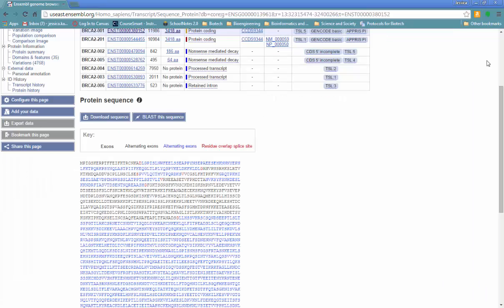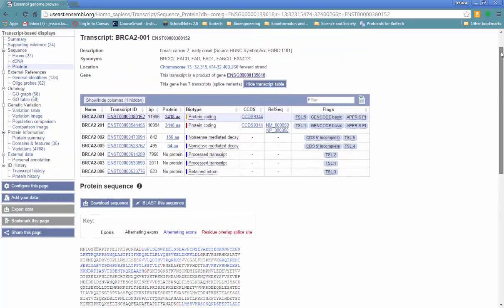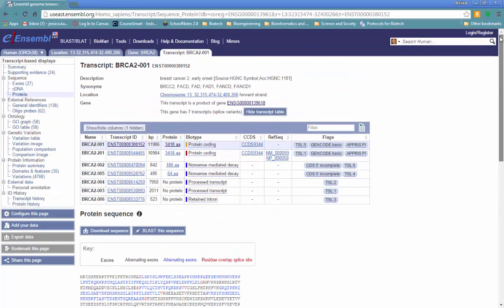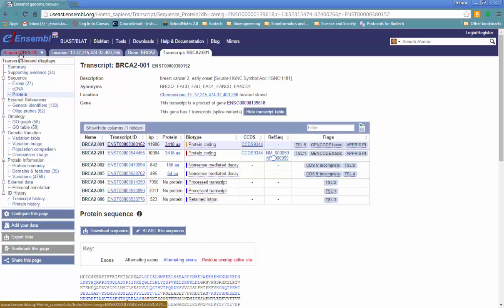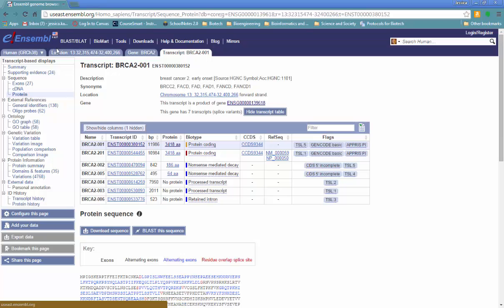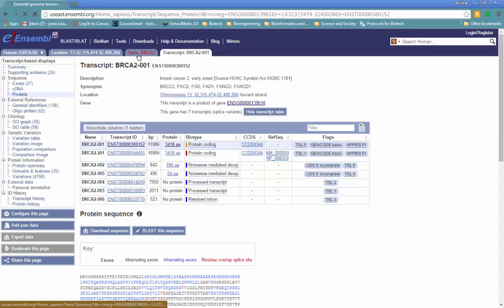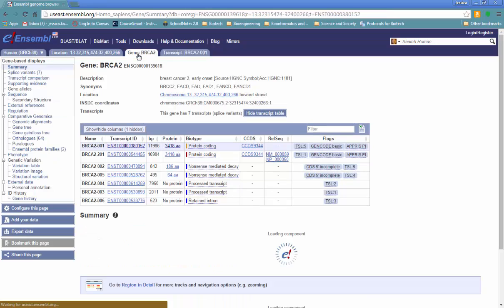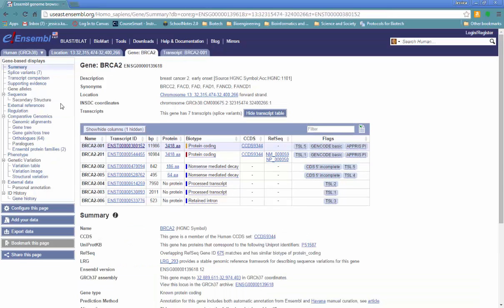So that is a quick guide to Ensembl. You can think of Ensembl as being genome-centered because we're always going to select the genome. And that genome tab will always be available. As we zoom in from genome to chromosome to gene to transcript, new features and new layers of information are available.